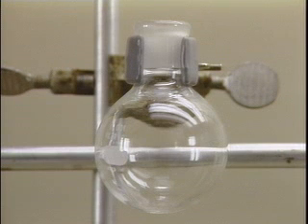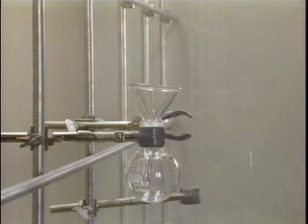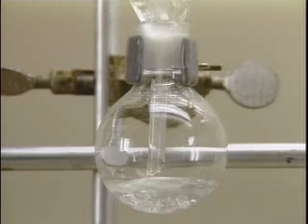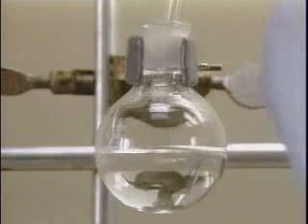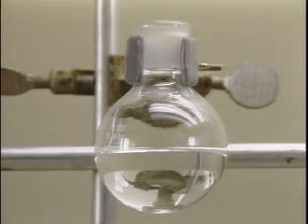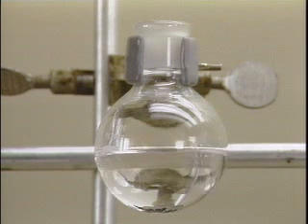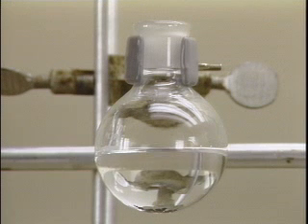The flask that is selected is clamped to a rigid stand. Additionally, large flasks are supported by an iron ring or a heating mantle. The liquid to be distilled is placed in the flask, and a few boiling chips made of porous, inert material are added. These chips provide a large surface area where boiling can be started. This helps to prevent the possibility of the liquid superheating and subsequently boiling erratically or bumping.